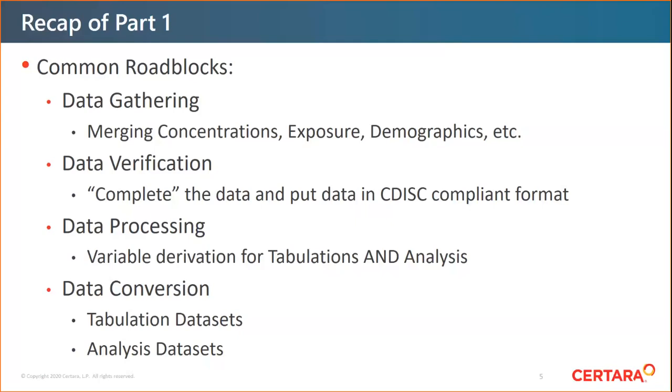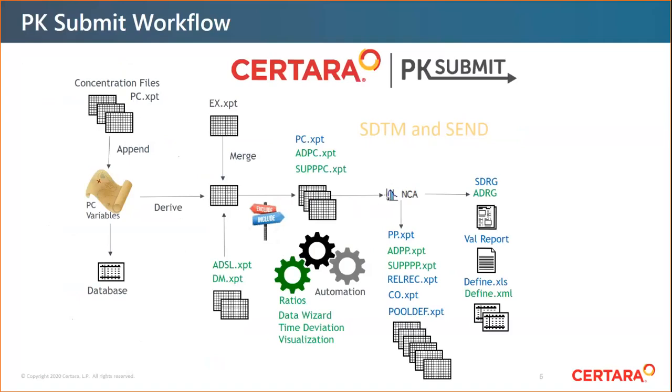Okay, so this is a diagrammatic workflow of PK Submit. If we look in the upper left-hand corner, we begin typically with some kinds of concentration files. Those could come from a LIMS system like Watson, or we might actually receive PC domains. I'll just make a quick note.